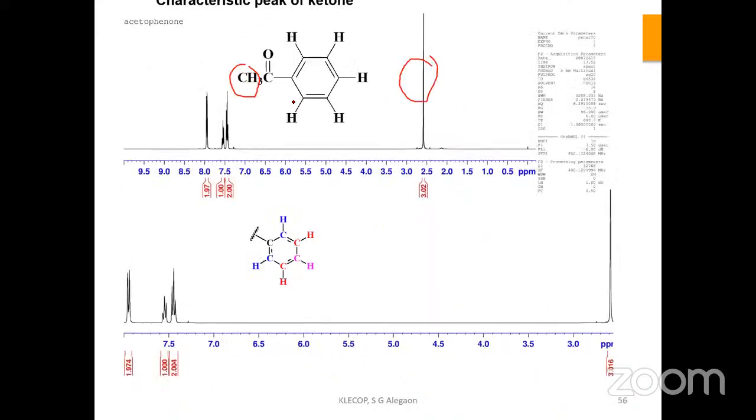But here you are not going to get the coupling between these protons and these protons. Only this proton coupling is not possible, but it is possible only in a higher condition where there is an NOE, nuclear Overhauser effect. In a higher condition you can observe it, in complex structures, to elucidate with HMBC and HMQC.